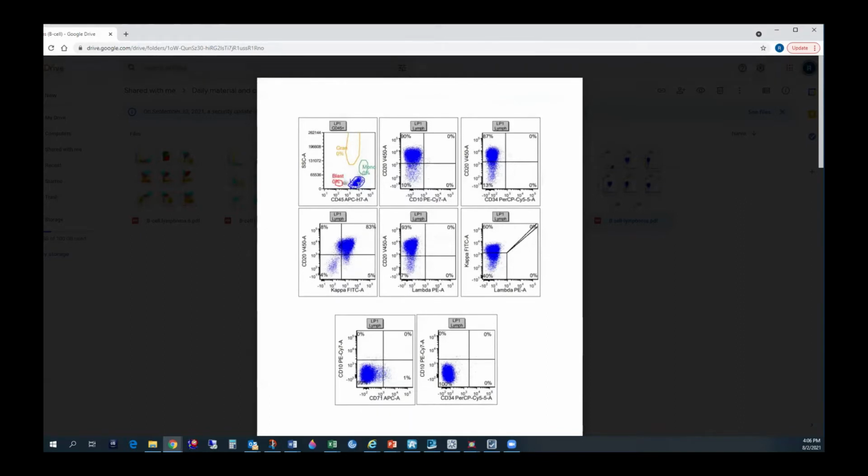I mean, like you said, it is possible in a peripheral blood with very high lymphocytosis, advanced CLL, you will probably see just the lymphocytes, but at least there should be some granulocytes. But it's okay. Even peripheral blood in advanced cases can look like this. You're right. And you are right that CD20 is moderate.